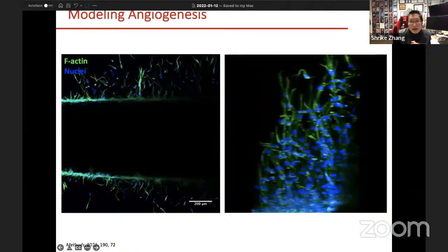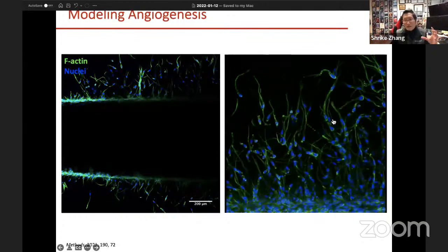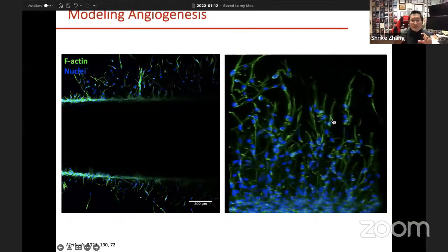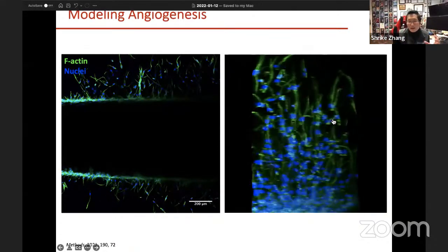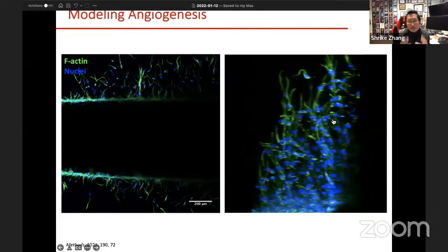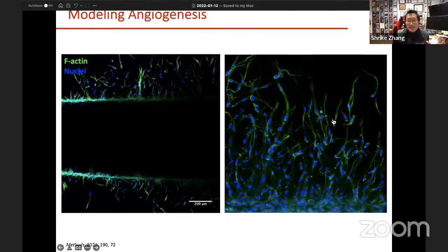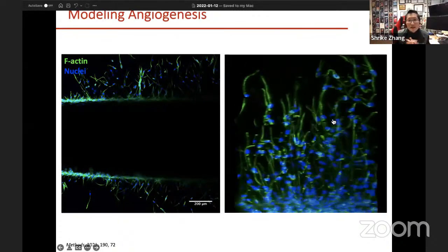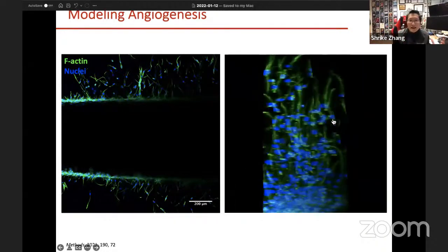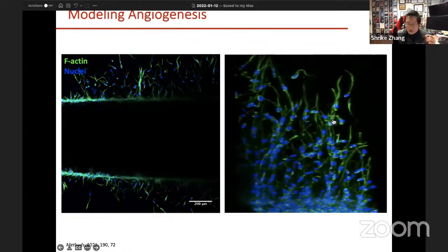And then if you culture them for long enough, right? Because again, you have the hollow channel that's initially printed, but then you also have the hydrogel matrices that are slightly compatible in the surrounding matrix. So if you culture these endothelialized microchannels for long enough, you can actually also induce secondary sprouting of these endothelial cells into the surrounding matrix to basically create this multi-scale vasculature within this bioprinted hydrogel-based construct.